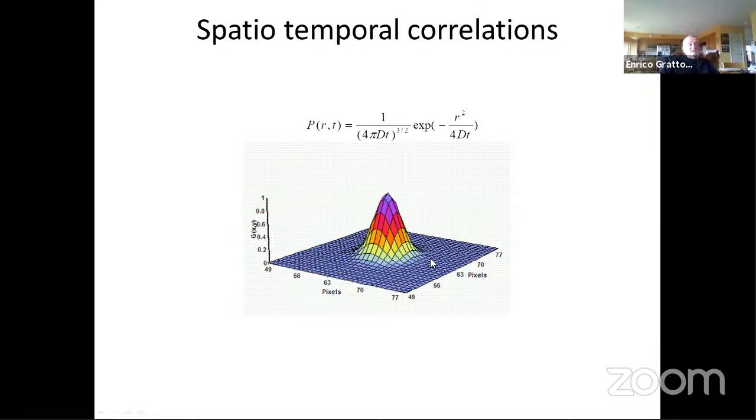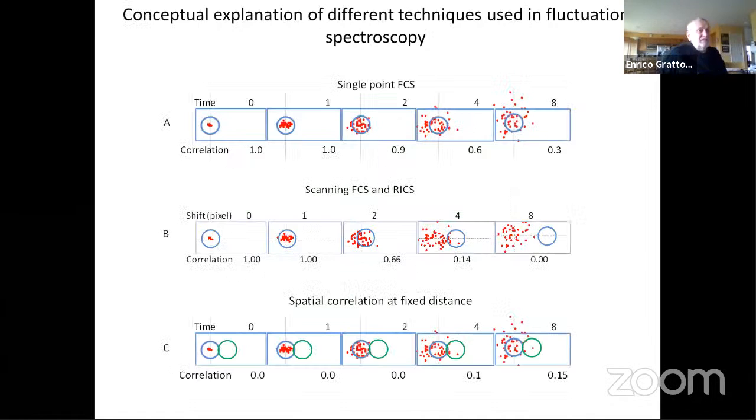So the question is, if we can measure all that distribution and the distribution as a function of time, we will have much more information, and that is done by the IMSD technique. So let us summarize most of the techniques I have discussed so far, and let us see if we can make a common point of all of it.